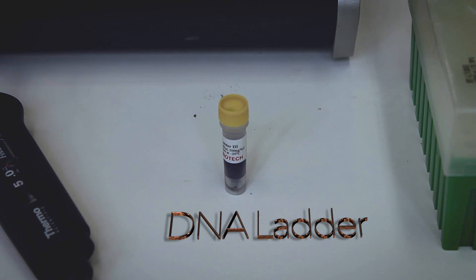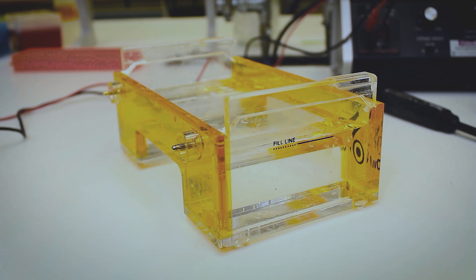The DNA ladder is used to scale the length of the DNA that was amplified. Fill the gel box up to the fill line with TBE and gently place your agarose gel into the box.